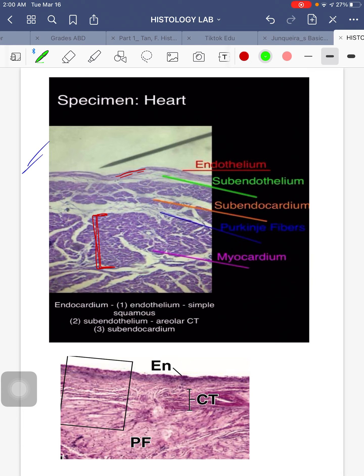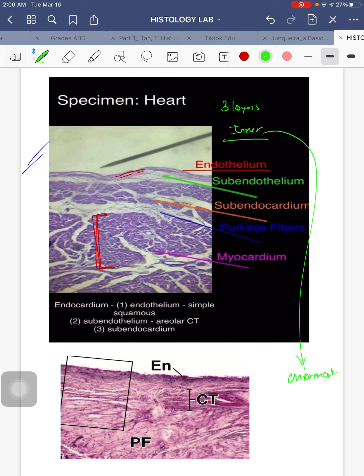The first specimen is your heart. It's important to know that the heart logically has 3 layers, and we will go from innermost to outermost. So the innermost layer is your endocardium — the innermost.